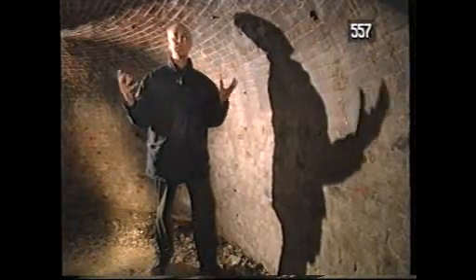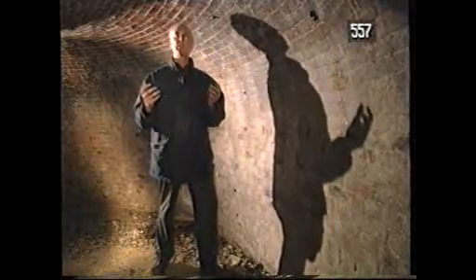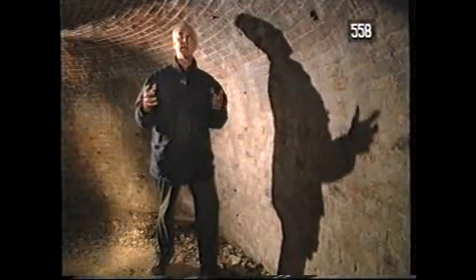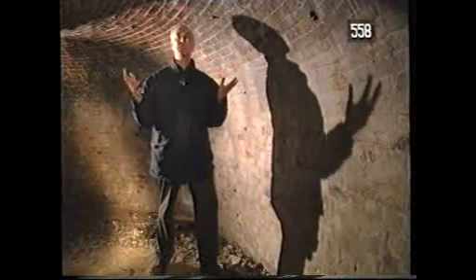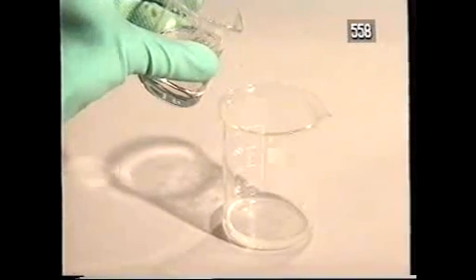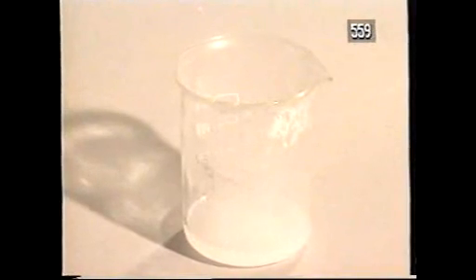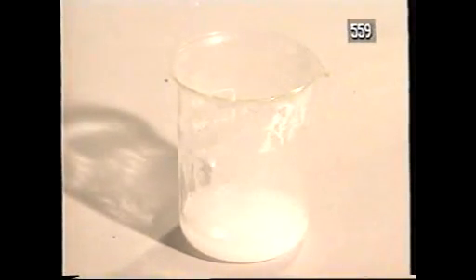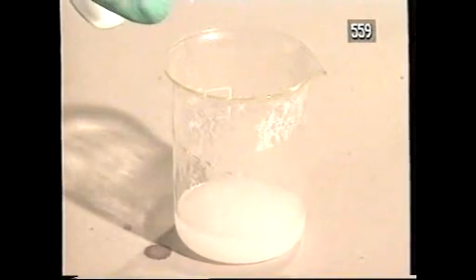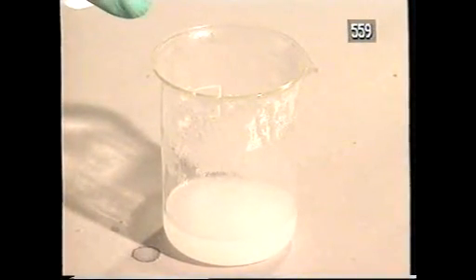But what happens when these two classes of compound are brought together? When, for example, concentrated sodium hydroxide reacts with concentrated hydrochloric acid? I'll show you now, and at the same time I'll read a 17th century description of the reaction. The solutions of the alkali and the acid are in their natures totally unlike, foes and adversaries of each other. And when the two are brought together, and the one has overcome and killed the other, neither a fiery liquor nor an acid spirit is to be found in their dead bodies.